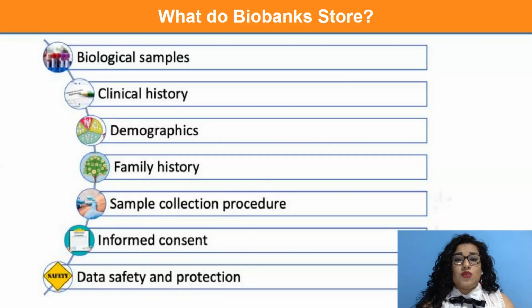Also, they can store sample collection procedures. With this, the researchers get information about the preparation of the patient, and the collection, processing, and storing of the specimen. The biobanks are also responsible for managing the informed consent. This type of consent is so important in clinical research to meet established compliances.